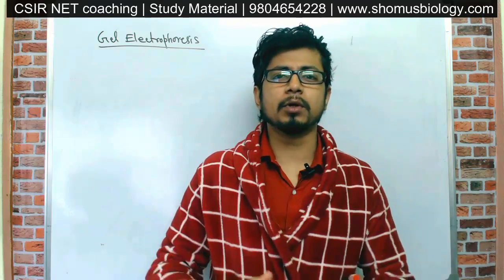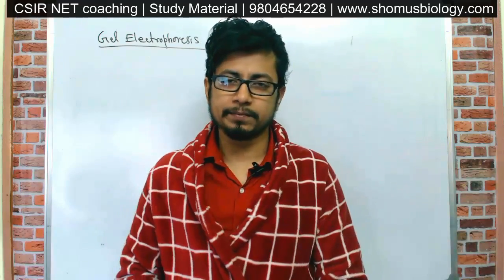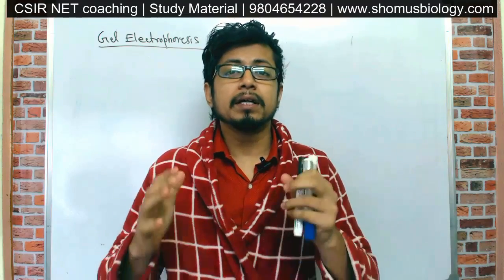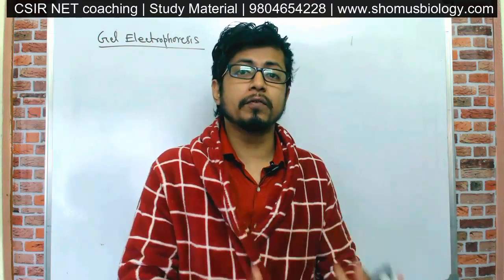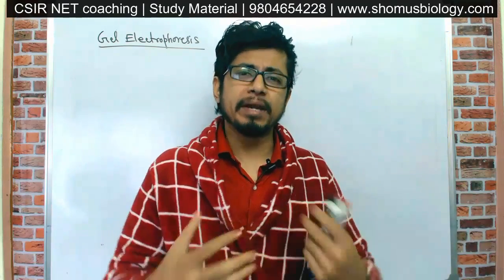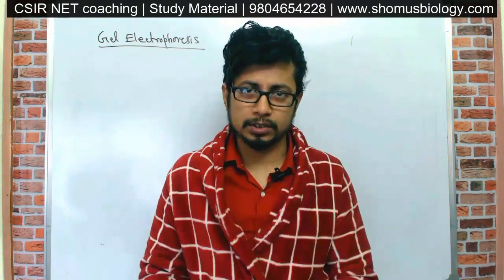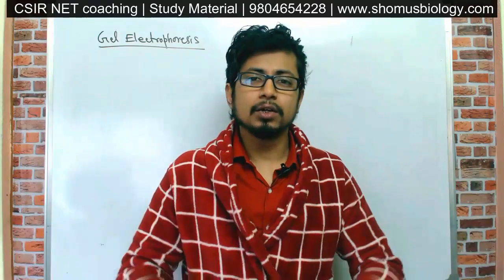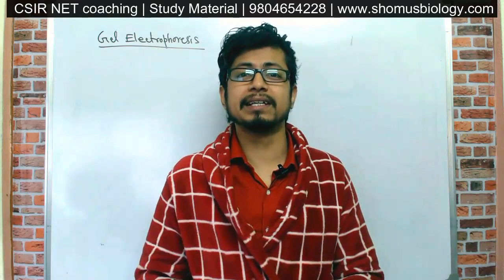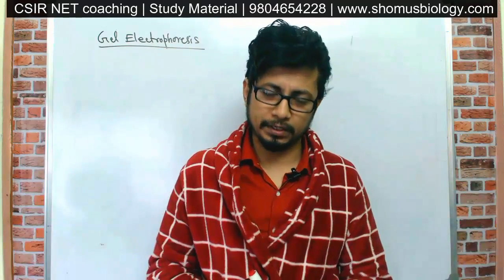And in this video lecture, we want to talk about gel electrophoresis. Now, when I use this term gel electrophoresis, it's a broad term, can be used for many different purposes, right? But the gel electrophoresis of what? The gel electrophoresis of a DNA, the gel electrophoresis of a protein, it can be of many different samples. So in very simple terms, I can tell you gel electrophoresis is a molecular technique to separate samples, which can be DNA or proteins, based on their charge and size. That's the very simplest form of the definition, okay?